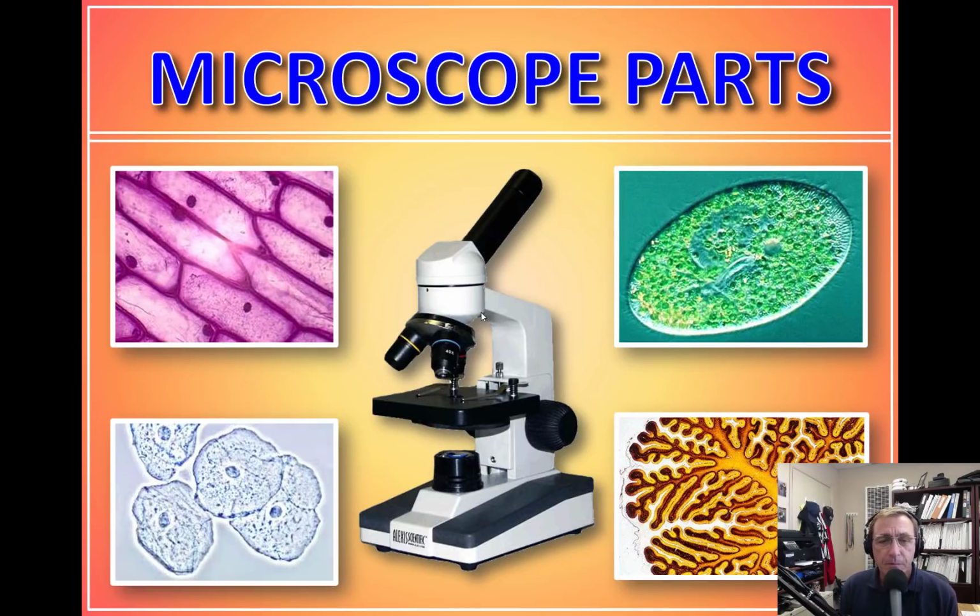So you see some sample slides, images you might see looking through a microscope. We bought for you some pre-done specimen slides, really cool. Already prepped for you and dyed so you can see them. Really fun stuff that you'll get to do later. But first, before you do any of that, you have to learn what a microscope is, what the names of the parts are, and how to use it.